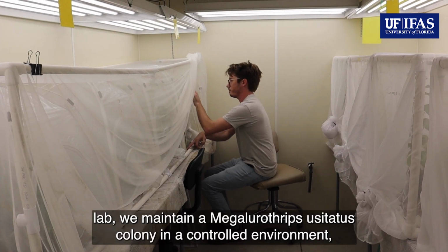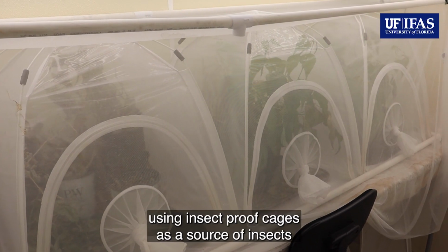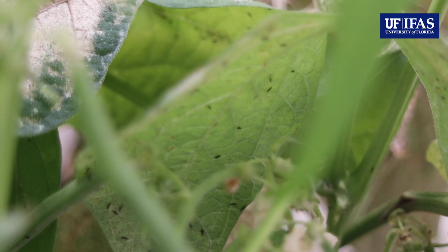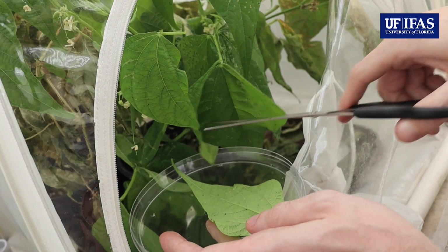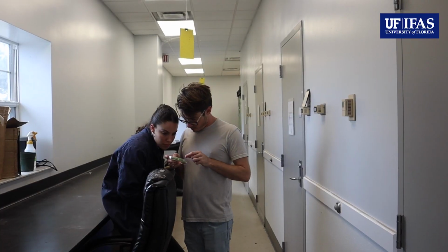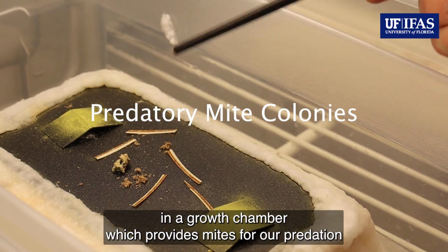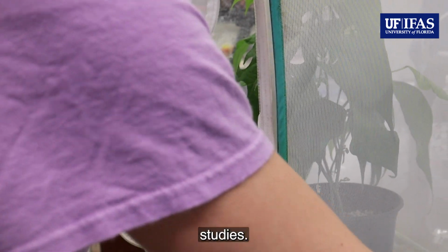In our lab, we maintain a Megalurothrips usitatus colony in a controlled environment, using insect-proof cages as a source of insects for experimental assays. We also have a predatory mite colony maintained in these rearing areas in a growth chamber, which provides mites for our predation studies.